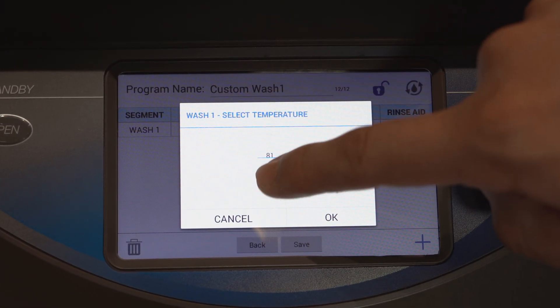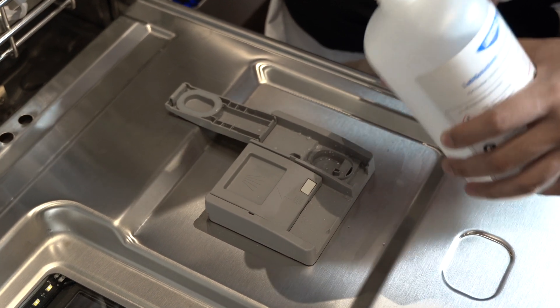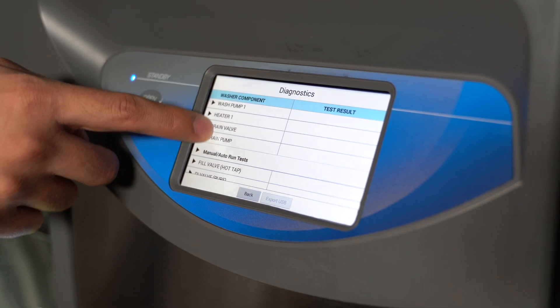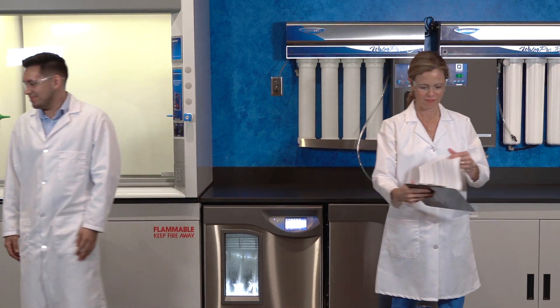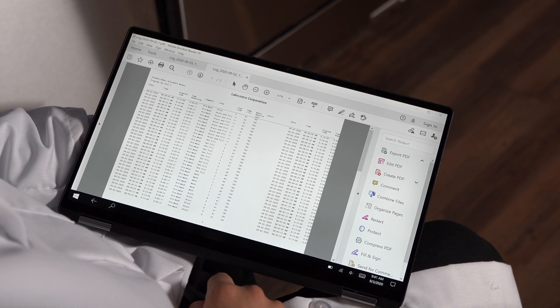Multiple heating configurations are available. CleanWorks OS will let you know when acid rinse solution needs to be refilled and keep meticulous records by exporting your wash or run data via USB or printing. You can even monitor each cycle using optional Ethernet data access.